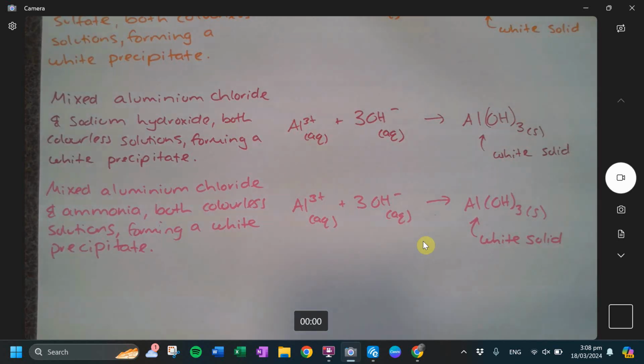What we should do is keep our boxes set up as is, so we don't need to remake them. So I'm just trying to think what would be our best option. I'd like them on a trolley, but I don't know if I have any more trolleys. Big one goes back in the black one, small one goes back in the blue one. Let's put them back on the back bench and I'll figure out where to store them, okay? So let's keep our equipment, everything that we are using. You can put the distilled water in the little beaker into the yellow beaker.